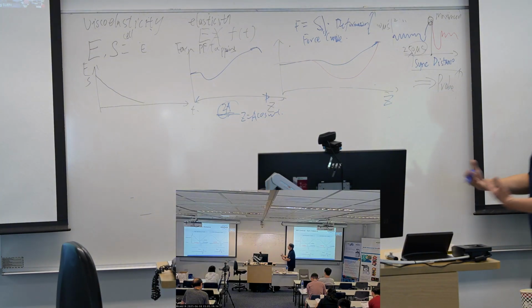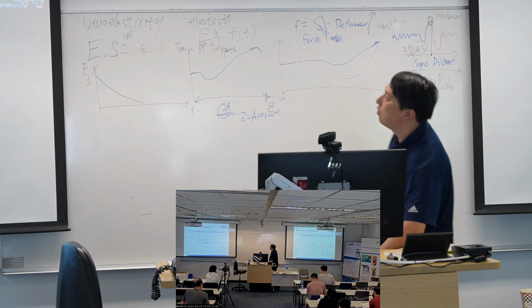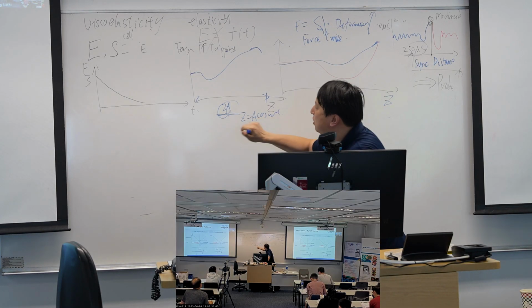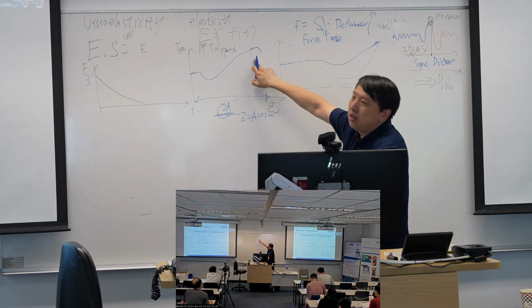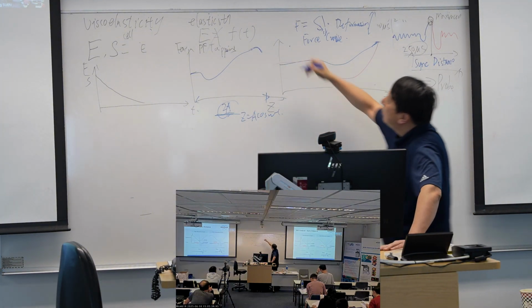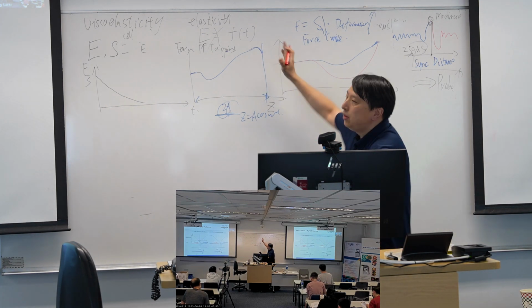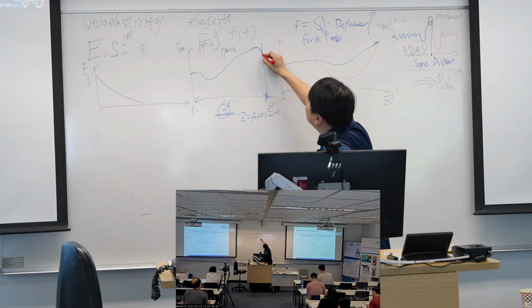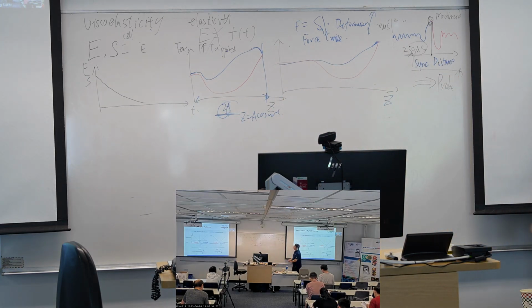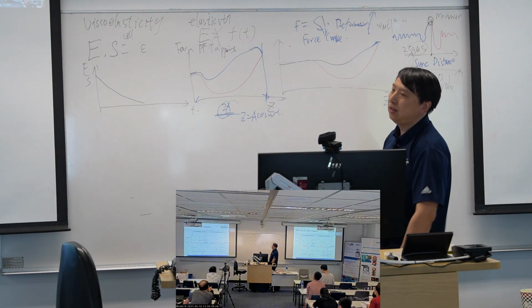Force drop. That's for some samples that have very high viscoelasticity. It means their stiffness drops too fast. And once we finish this 2A distance, the sample is already so soft, and the force may drop. And then once it reaches this 2A distance, my probe is retracted back. The force curve I get is something like this. So that's maybe the real force curve I captured for some viscoelastic samples.